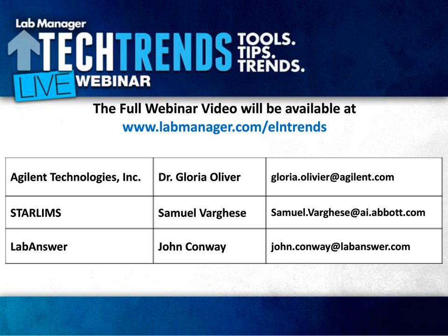So that interim data that you would normally have in a different tool is what would be captured within the ELN. So it would be both structured data, which would be more complex calculations, more complex workflows that need to be put in outside the LIMS, as well as freeform, where you would bring in a picture off of a microscope and annotate it, or maybe create a chart or a specific table on the fly. So those are additional things that you don't have in the core LIMS process, but you still want to be able to capture in an electronic format and make it available as part of the permanent record.